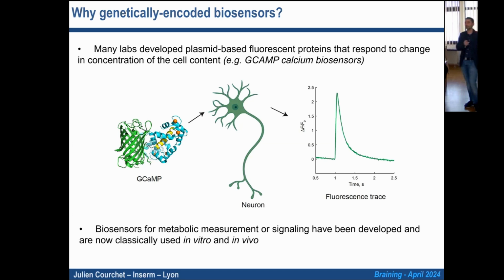the fluorescent properties. And one very classical experiment that you have all heard of is GCaMP, which is the most commonly used biosensor for calcium. So GCaMP is basically a GFP molecule that is attached to a module that will bind to calcium. And depending on the binding of calcium, it will just close the barrel or open the barrel. So you express that in your favorite cell, in a neuron, by transfection or by electroporation. This is an easy step. This is all based on plasmids. And then you can, with a single microscope, detect GFP fluorescence, green fluorescence. So pretty much all the microscopes can do that.